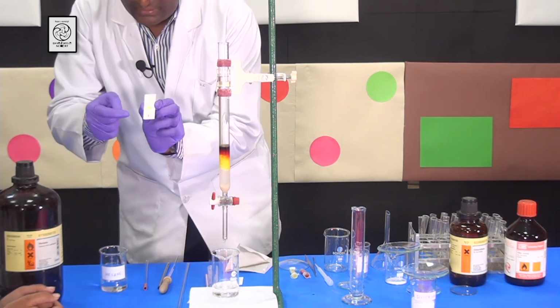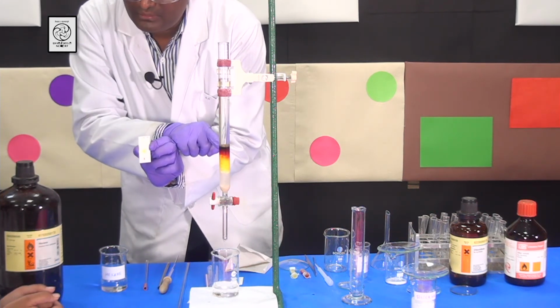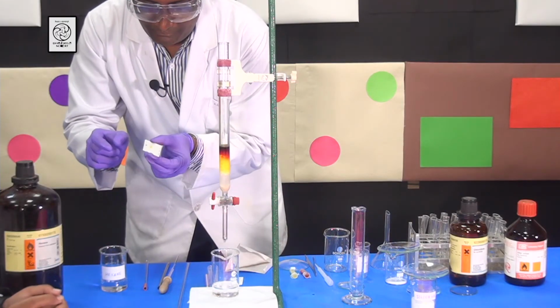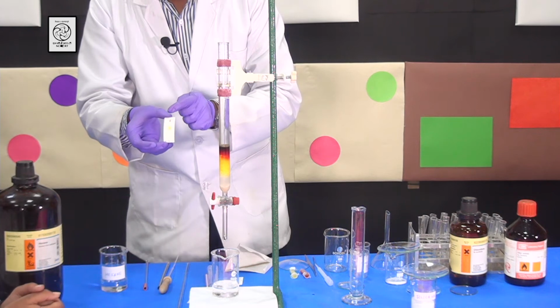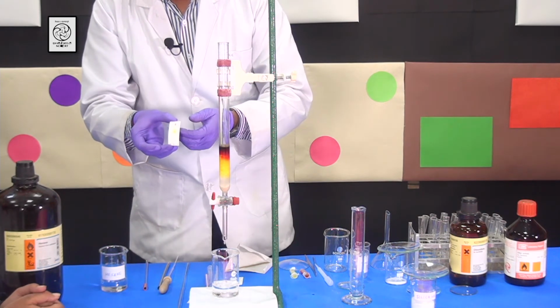And the red compound at the bottom, which you can see here, is coming a little slower. Wow, it's beautiful. You can say that the pattern is actually upside down compared to that of TLC, because TLC runs against gravity, whereas the column runs towards gravity.